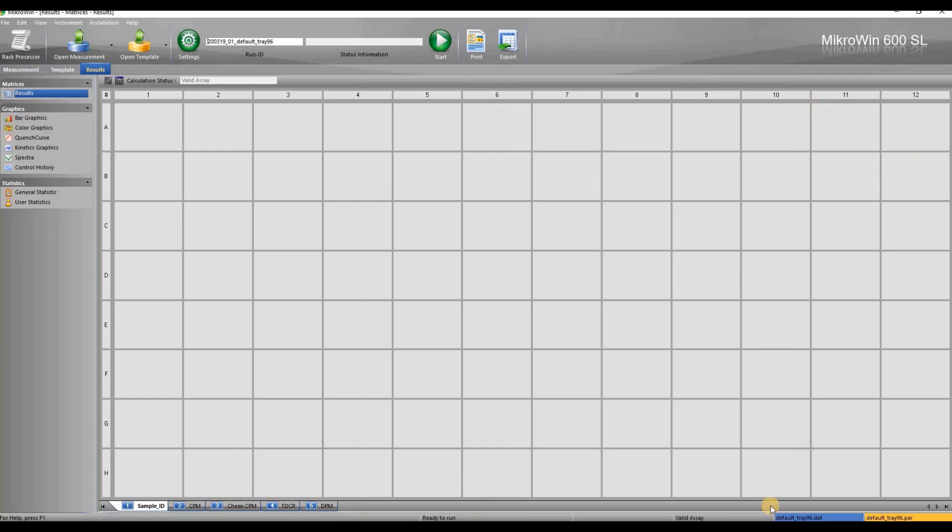From the bottom right corner you can see which data and template are open. When opening MikroWin there will be default data and template open.